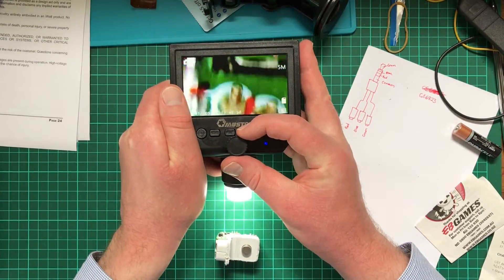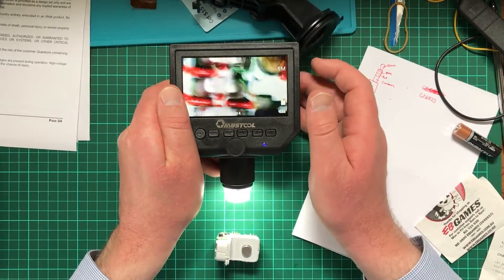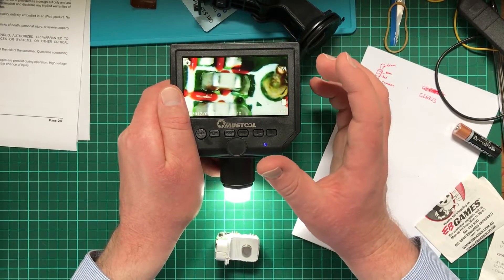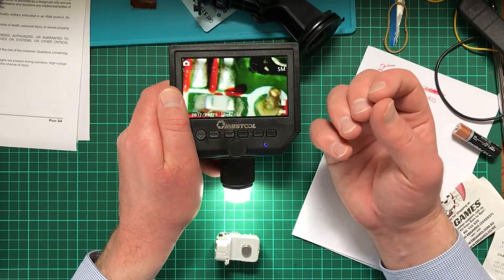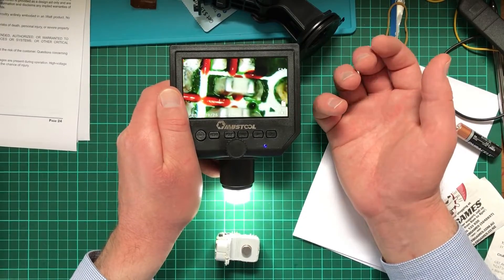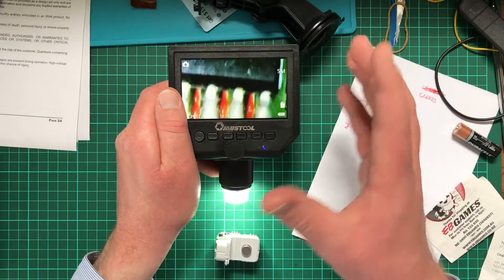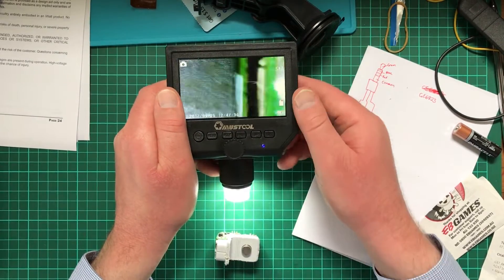Because I can't hold this exactly 100% still, you should be able to make out what I've found: if you're going to be using this in a room with fluorescent lighting, you're not going to get a particularly good image. When I was taking recordings and photos in a room lit with fluorescent lights, and also at night, the image would come out washed out. Taking it during the day when you have usable daylight, the image is more or less in colour — still grimy, but somewhat acceptable.